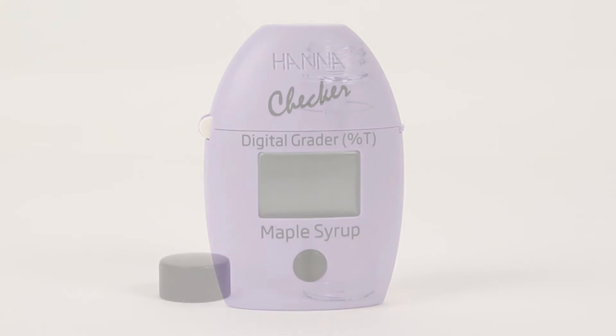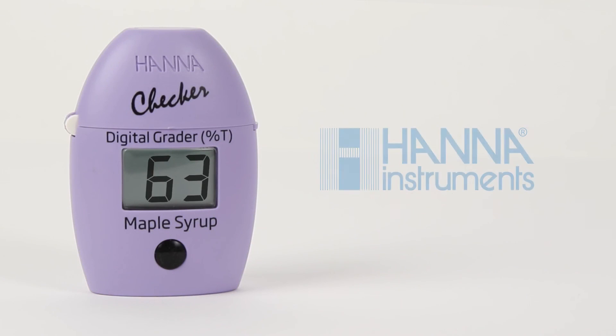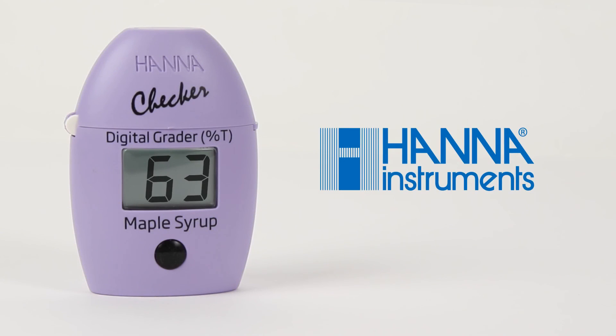The glass cuvettes and caps may be cleaned like any glassware with soap and hot water. Be sure to rinse thoroughly and dry completely before using. Rinsing with purified or deionized water is recommended to reduce streaking and deposits. To purchase additional cuvettes or for more information on this product or any of our other products, please visit our website.